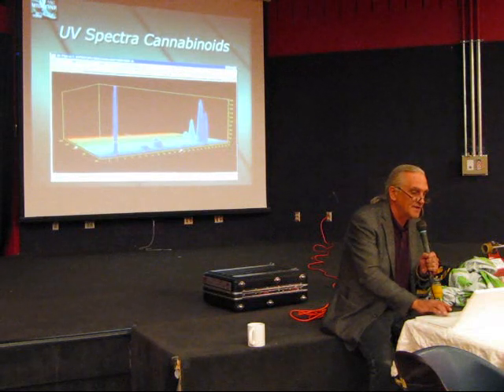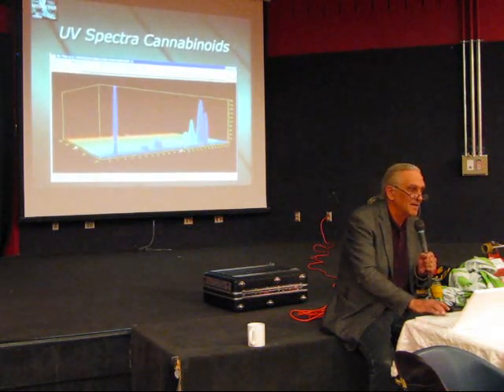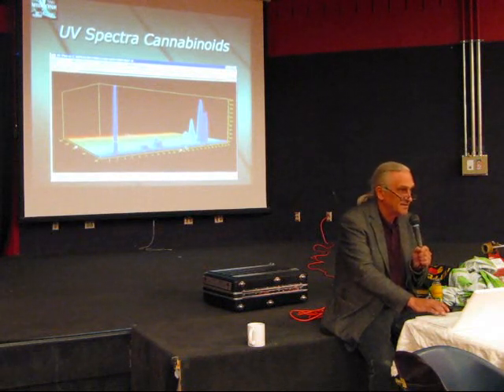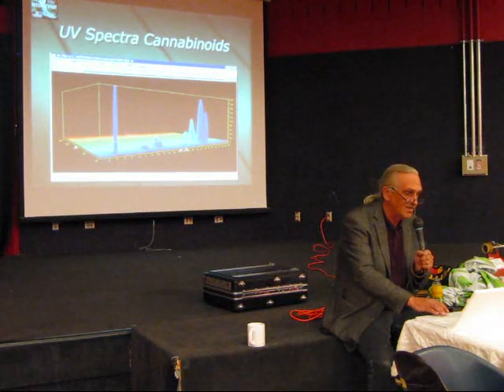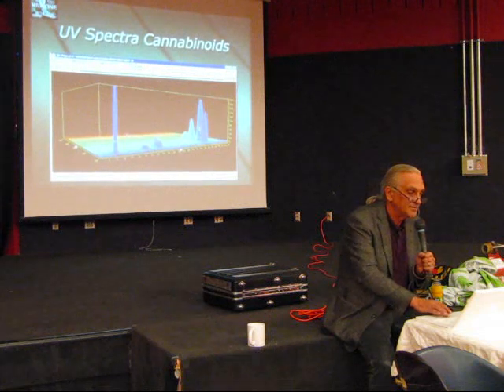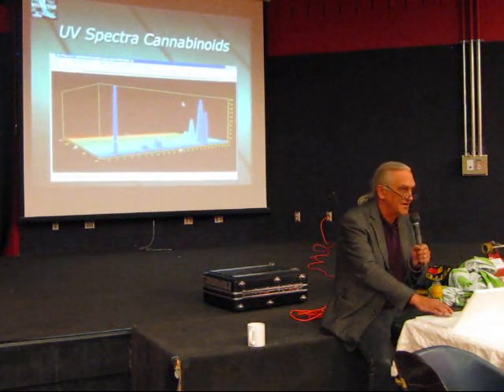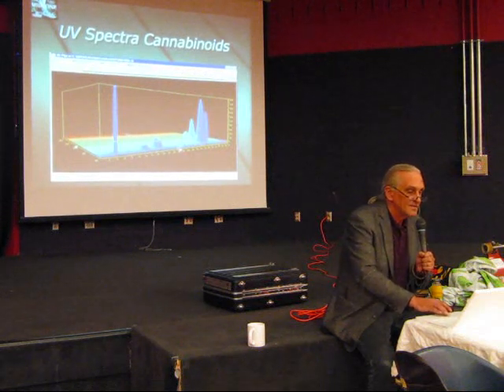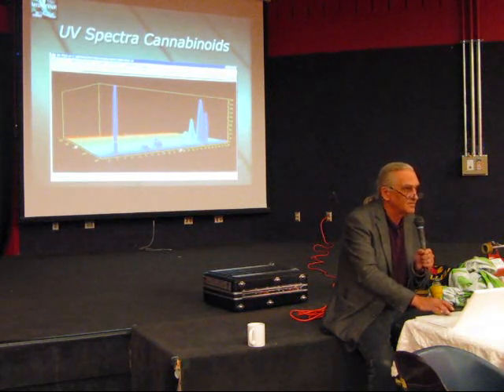This is THC acid. When you burn it, it turns into THC, which is right here, that little tiny one. Because in nature, THC is present as the acid. You've got to burn it, you've got to heat it up. In a brownie, you'll burn it in the joint to decarboxylate it to turn it into THC. When you do that, this peak will go down to here, and it'll come up over here, because the chemistry has changed. This here is cannabinol, and this is cannabidiol. But see, the proportions are much smaller for the other cannabinoids.